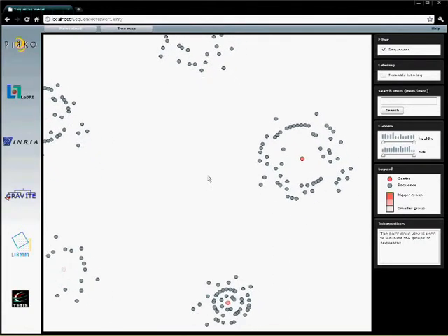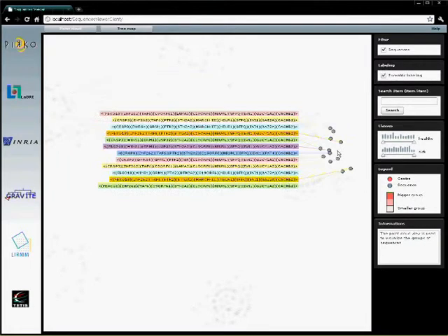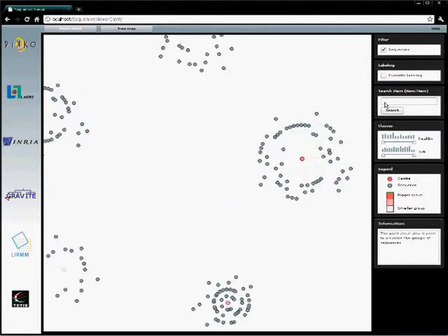We can zoom in and move the whole map. Using eccentric labeling, we can see the labels of the sequences positioned close to a point and click on them. Here, one can observe that most of the sequences in this group contain the ZNF262 gene. Let's see if it is also the case for the other groups when using the search engine.